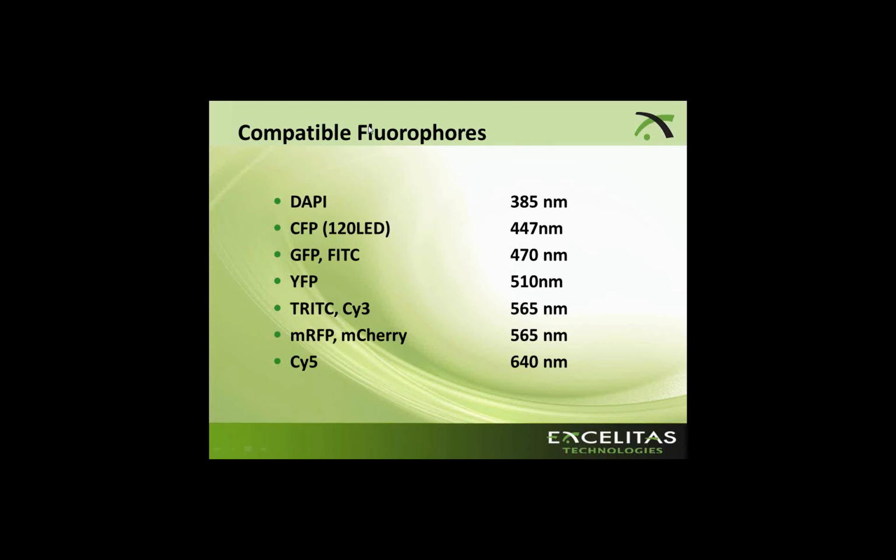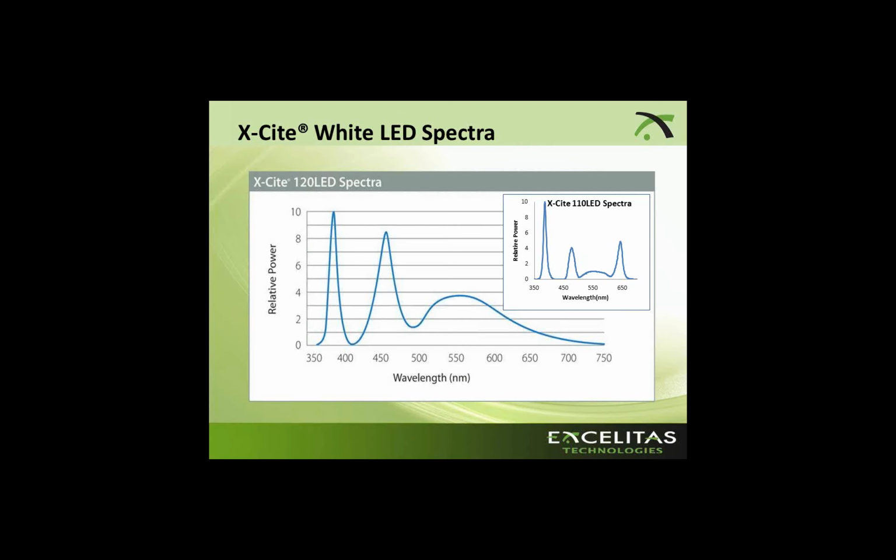If you are looking at something up here in the Fura range or something down here in the far-red range, as of today, an LED would not be a very good solution for you because we just don't have the power in those kinds of areas.